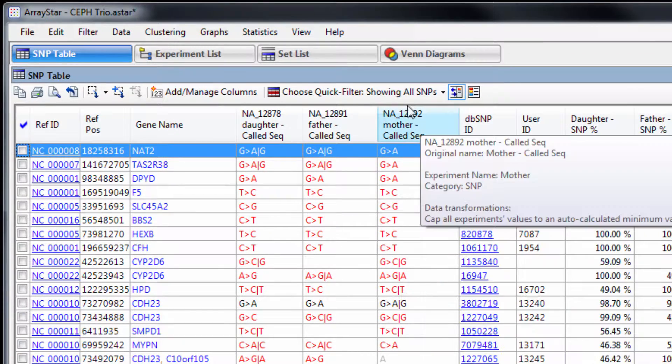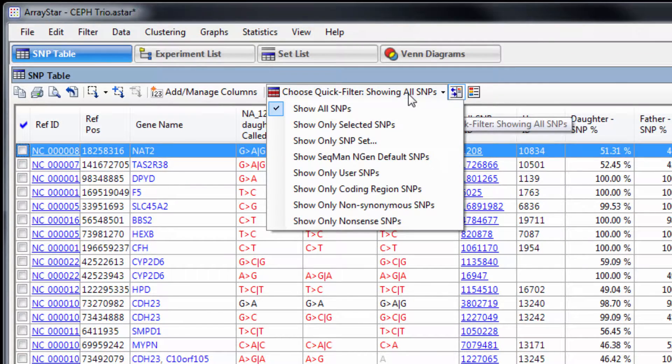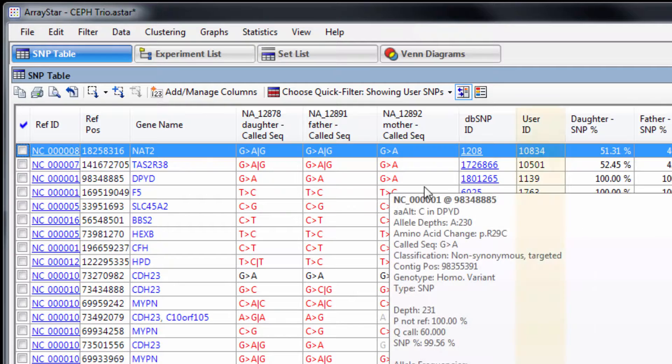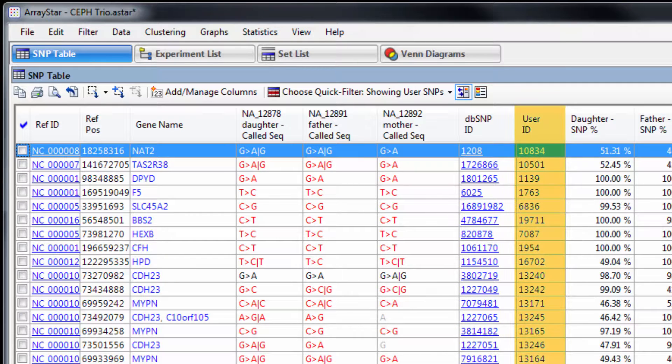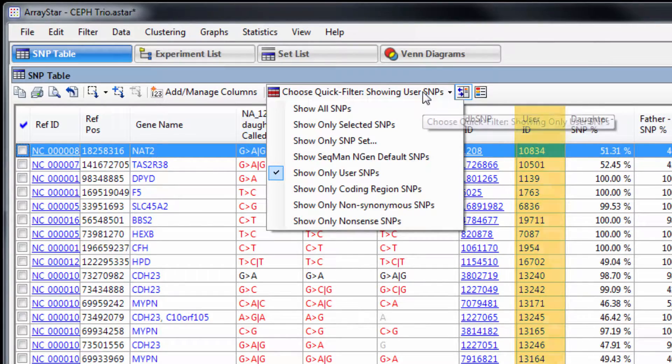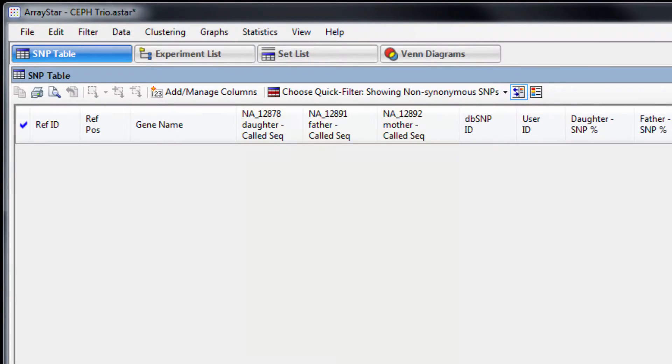If desired, we can do some quick filtering on this list to show, for example, only user SNPs. These are the variants that are present in the VCF file we loaded during assembly. Or we could show only non-synonymous SNPs.